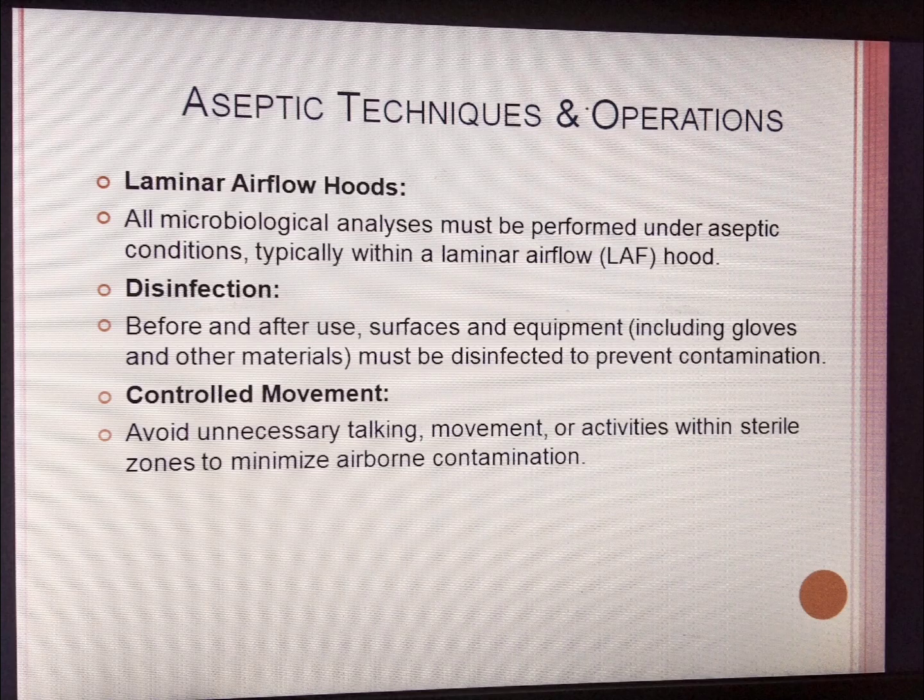Aseptic techniques and operations. Laminar airflow hoods. All microbiological analysis must be performed under aseptic conditions, typically within a laminar airflow, that is LAF hood. Disinfection. Before and after use, surfaces and equipment including gloves and other materials must be disinfected to prevent contamination. Controlled movement. Avoid unnecessary talking, movement or activity within the sterile zone to minimize airborne contamination.